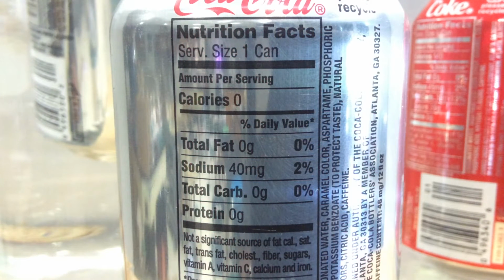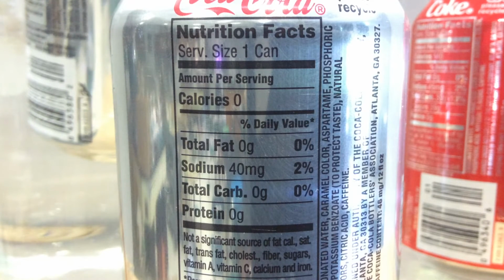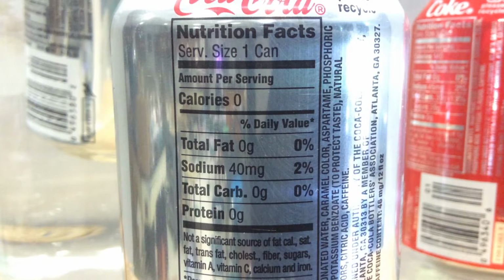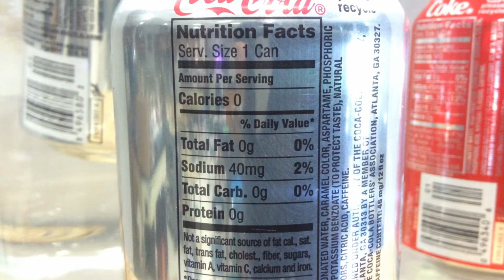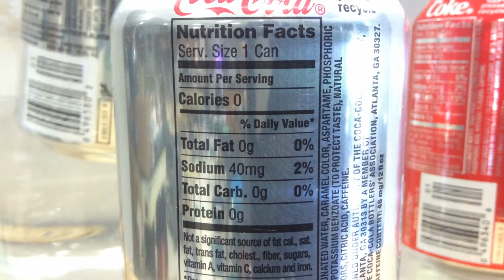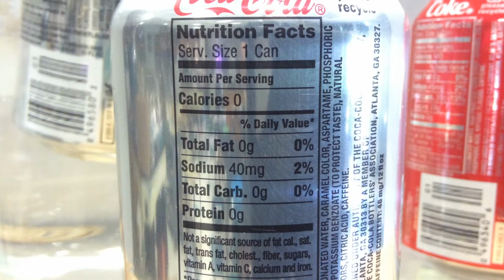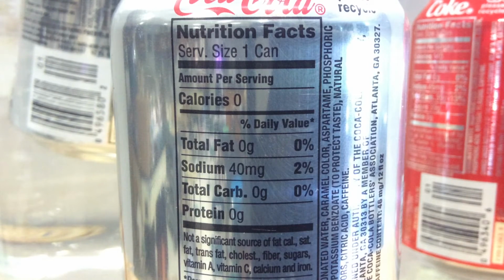In the Diet Coke can, we can see the nutritional facts clearly state that there are 0 carbohydrates. Okay, so the major premise of this lab that we're going to test by trying to calculate how many grams of sugar are in regular Coke is we're assuming that this can of Diet Coke has no grams of sugar, and that's the only difference between them.